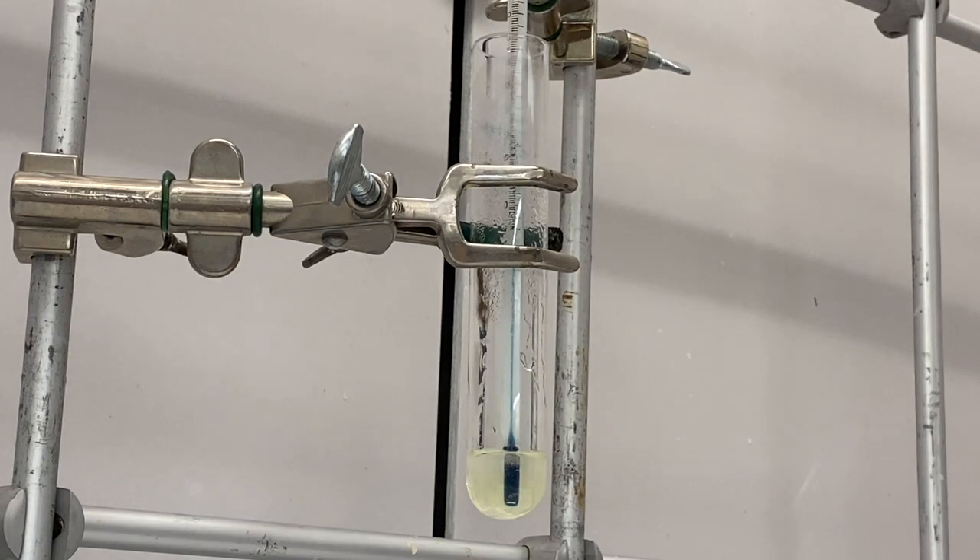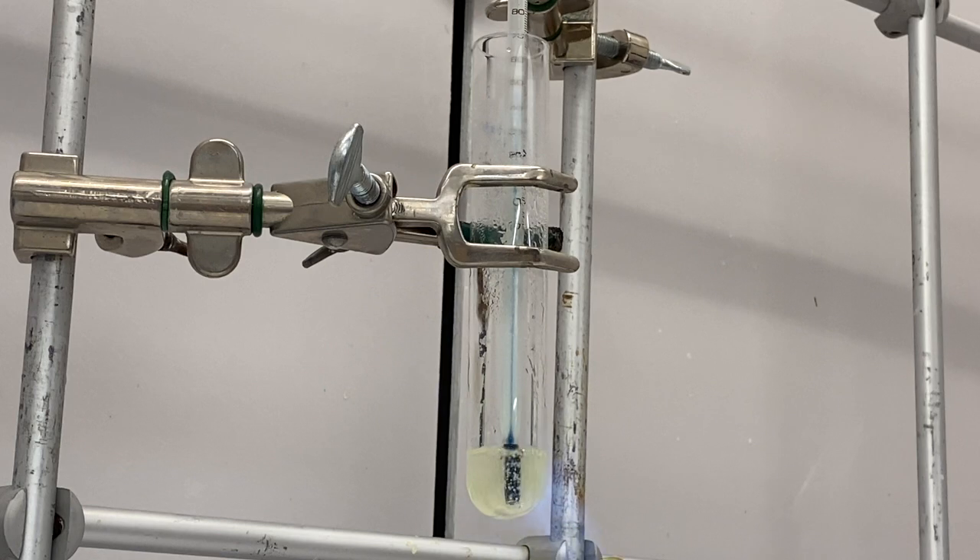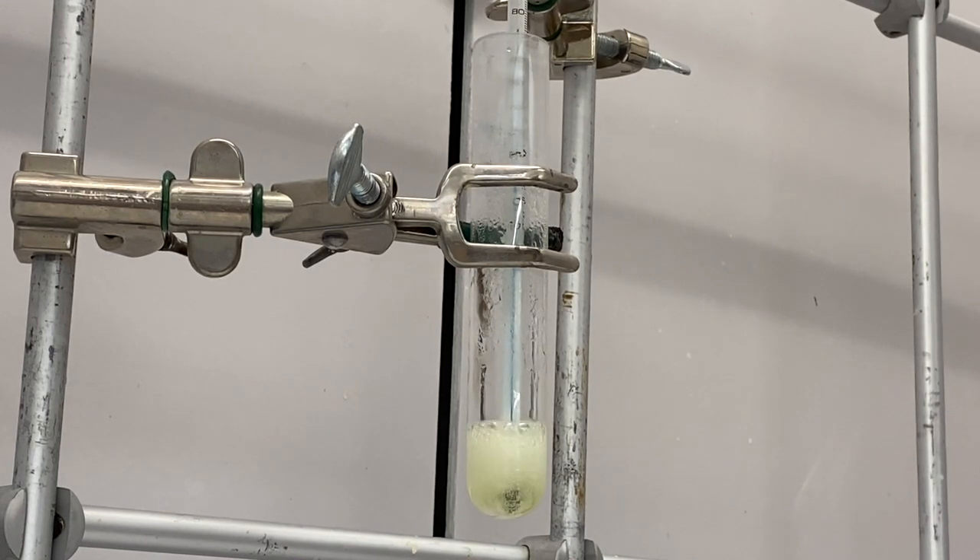We're going to heat this to between 110 and 130°C with the goal of driving off the water. You'll be able to tell the water is gone when you're around 100 to 110 degrees and you don't see any more bubbling. The triethylene glycol has a really high boiling point — it won't boil at 100 degrees — but water boils at 100 degrees, so all this bubbling is because there's still water in the solution.